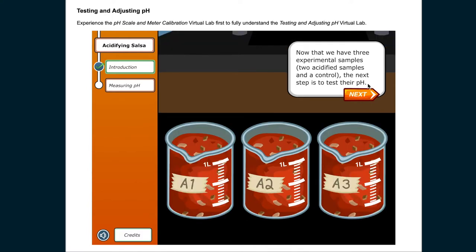Now that we have 3 experimental samples, 2 acidified samples and a control, the next step is to test their pH. We will take 2 smaller samples from each of A1, A2, and A3 and test each of these smaller samples 2 times.